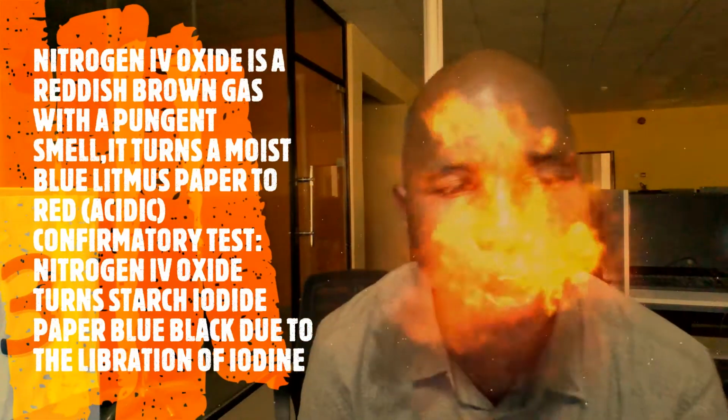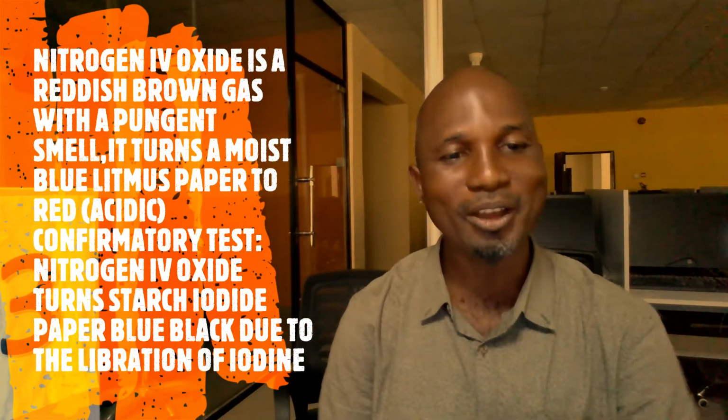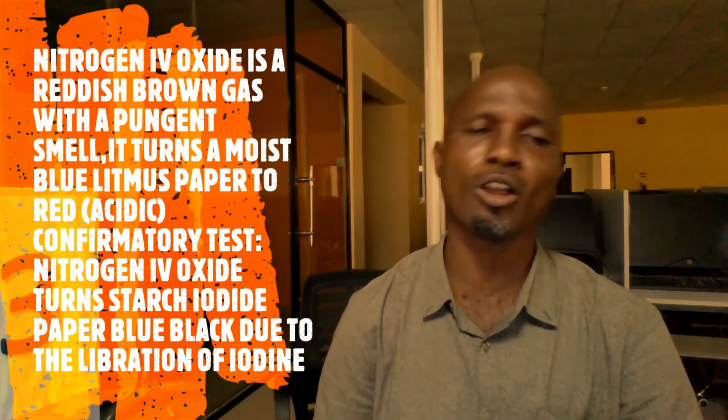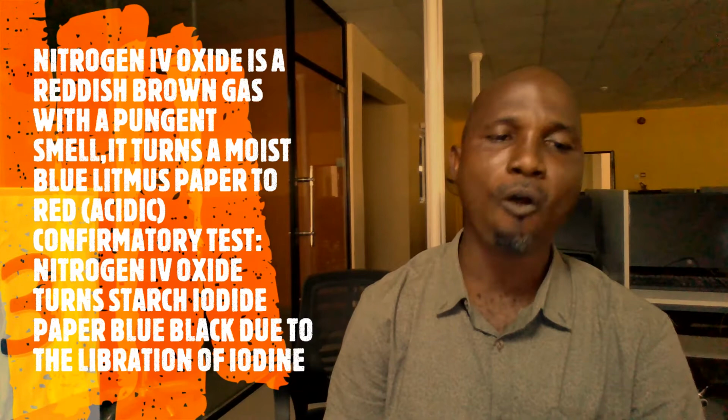The next one is nitrogen 4 oxide. There are gases that are colored. Nitrogen 4 oxide is one of those gases. The color is reddish brown. When you see a reddish brown gas, what should come to your mind is nitrogen 4 oxide. It's not the only gas that is reddish brown though. Bromine can possess the same color, but nitrogen 4 oxide will turn a damp, moist blue litmus paper from blue to red because it is acidic.